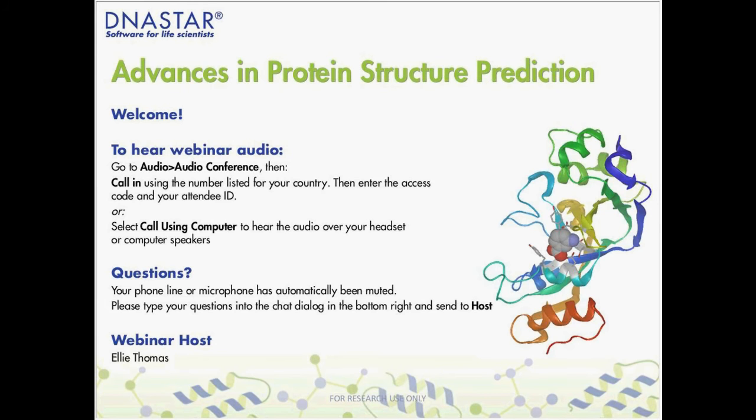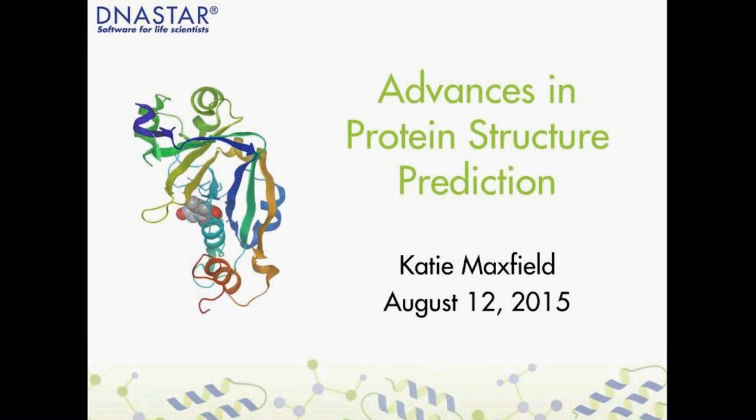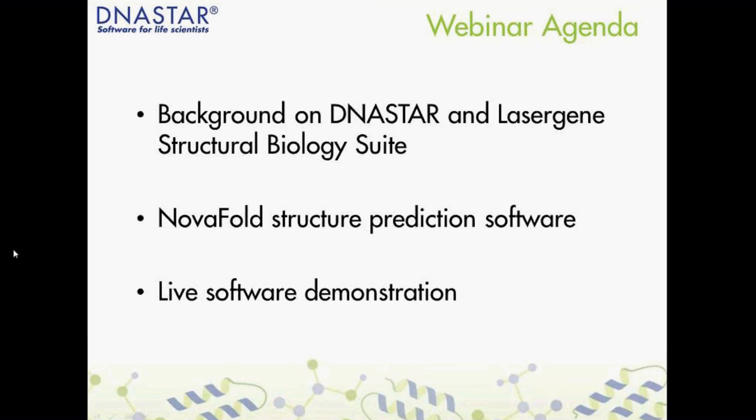Thank you, Ellie, and thank you all for joining us today. As Ellie said, my name is Katie Maxfield, and today I'm going to be presenting DNASTAR's Protein Structure Prediction offering. This is part of our Lasergene Structural Biology Suite of applications. First, I'll give some background on DNASTAR and our software, and then I'll be getting into some more detailed information about our NovaFold structure prediction offering.